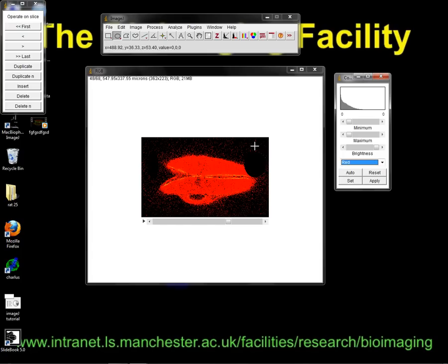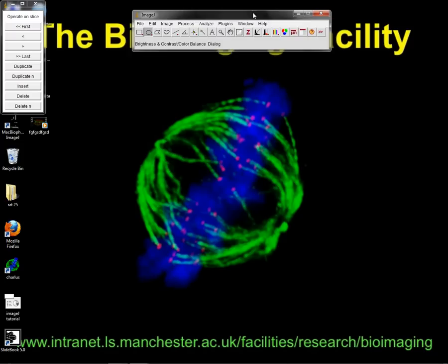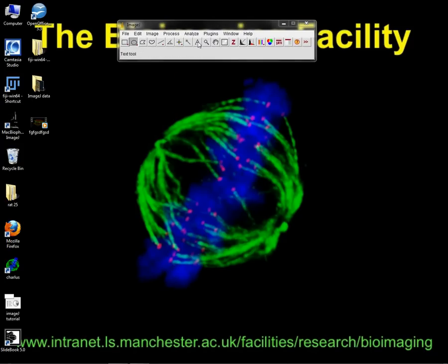If you draw regions of interest and delete them to get rid of bits of speckles and things like that, it's not right, you know? It's a point artifact. There's ways you could get around it, crop it out of your image, crop the image to get rid of the piece of debris. Just using the paint tool or the delete tool is a little bit naughty. And the journals will pick up on it and you'll get ridiculed.